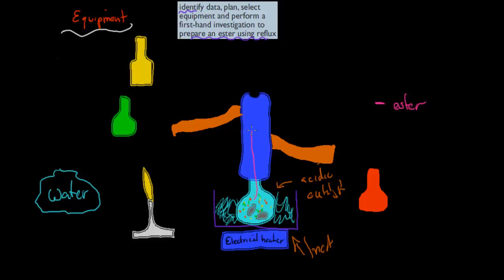The ester will move up, and this is in the gaseous form. Because there is water flowing through these pipes, that means it's basically cooling it, it's condensing it. That's why it's called a condenser. That's what we consider reflux, just when we have our vapor going back into its original liquid form. So we have condensation happening here. And then this will drop back, because it's liquid, it doesn't rise anymore, it's going to drop back into solution. And over time, we're going to have more and more ester being formed in our original solution.